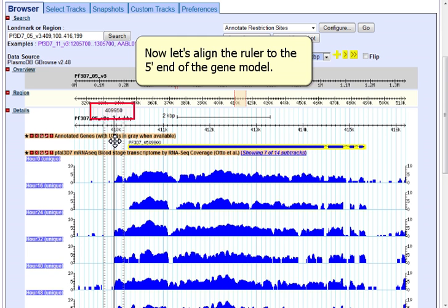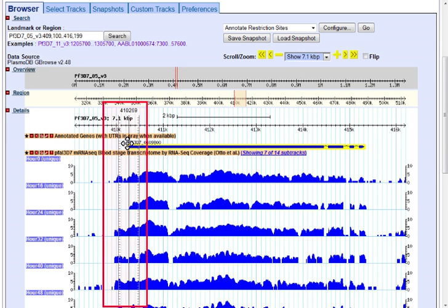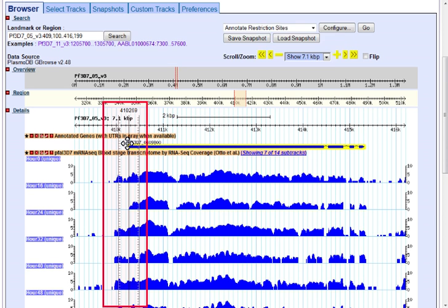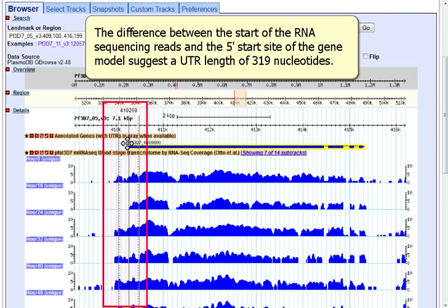Now let's align the ruler to the 5' end of the gene model. The gene model begins at nucleotide 410,269. The difference between the start of the RNA sequencing reads and the 5' start site of the gene model suggests a UTR length of 319 nucleotides.